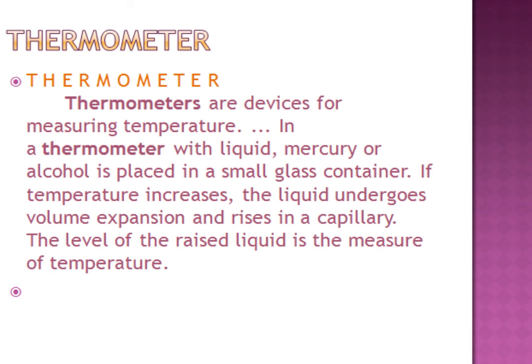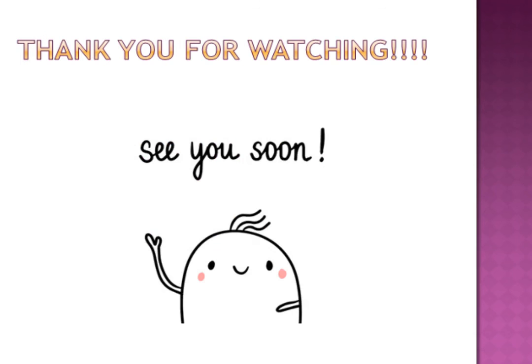So I think we all know what a thermometer is, right? It is a device used to measure temperature. Did you know that there are lots of types of thermometers? Some examples are digital thermometers, electronic ear thermometers, glass thermometers, mercury thermometers, alcohol thermometers, etc. I'm not going to talk about thermometer uses today, maybe some other day, but for now, we've finished our lesson and chapter about apparatus.